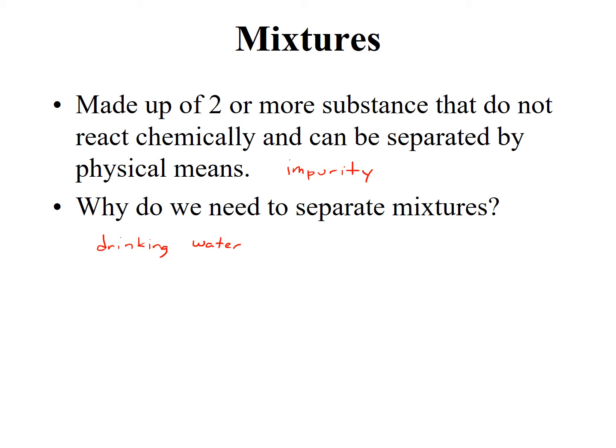If we look at it, it's a mixture of silt, sand, salts, and water. Now, we want our drinking water to be pure. So in doing that, we want to remove all the impurities that it has.